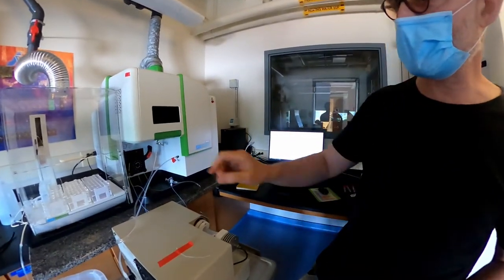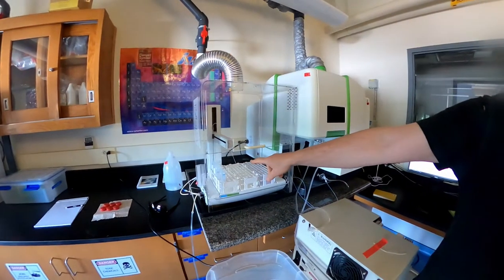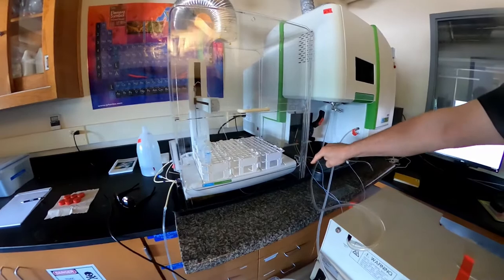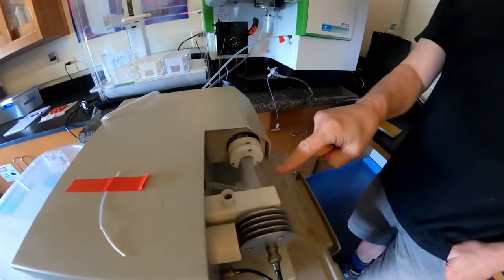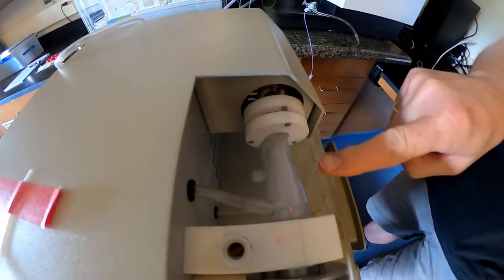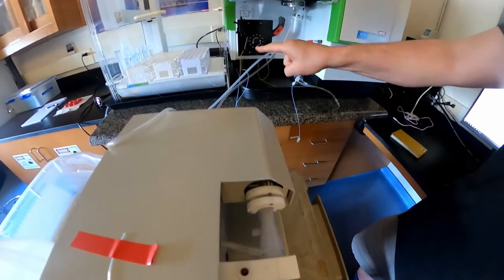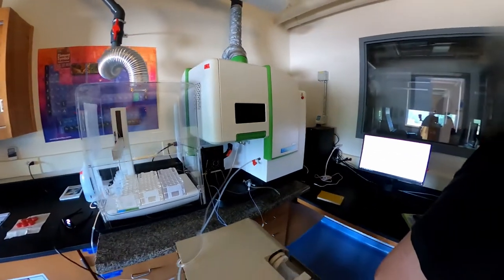It takes a couple feeds. This is a sample, auto sampler. So your samples will go in here. And that auto sampler will feed a little stream of liquid into here through a pump. That pump will come through here to something called an ultrasonic nebulizer. You can see that kind of white cloud of moisture. That's the sample right now. And that will then be fed back into the machine and into the spectrometer. We require some other support for this. We require some gases.